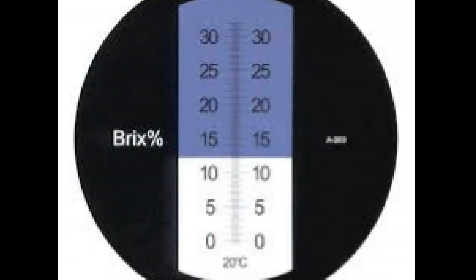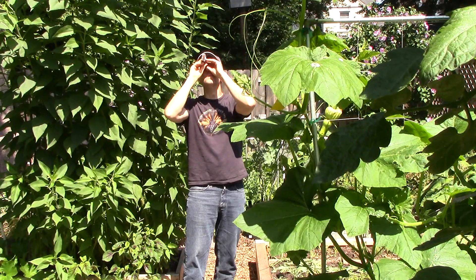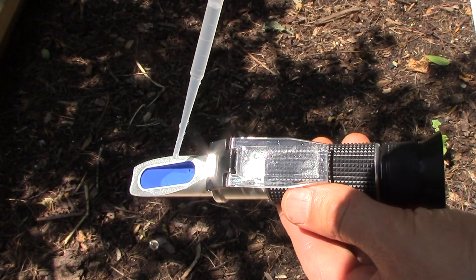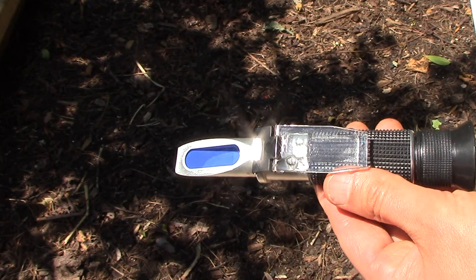I closed the daylight plate over the prism and looked into the eyepiece to determine the Brix reading. The view inside the refractometer looks something like this — the Brix value is the point at which the blue and white colors meet. For the first tomato, the blue and white met right at 9. After each test, I cleaned out the prism and daylight plate with distilled water to ensure the integrity of each individual test.